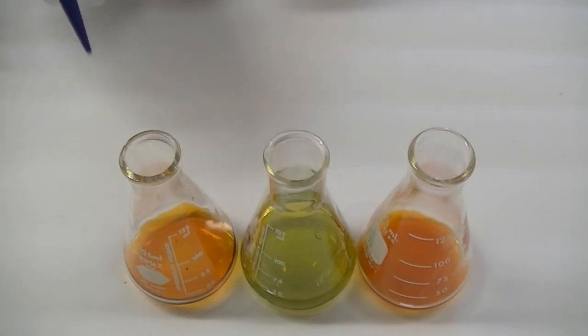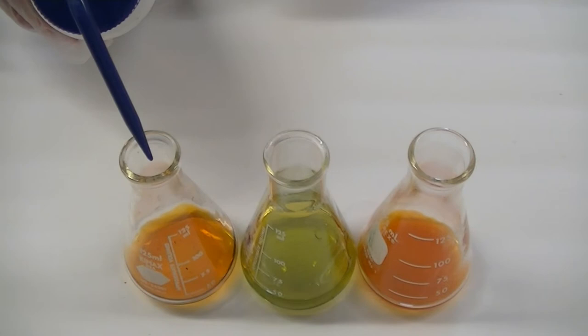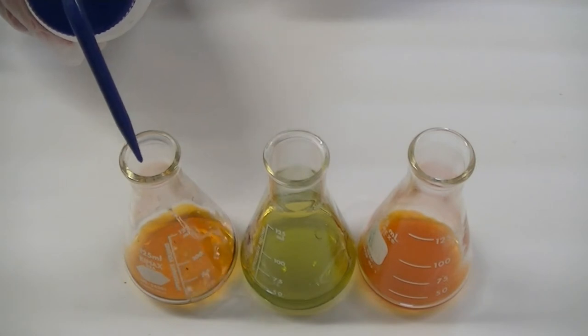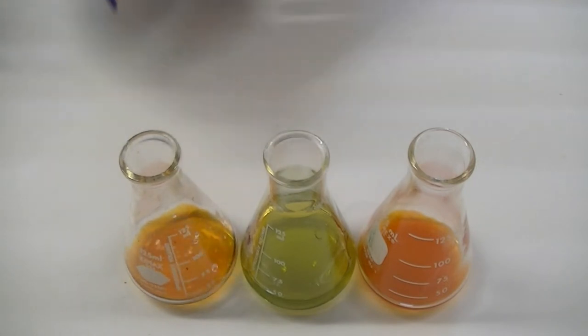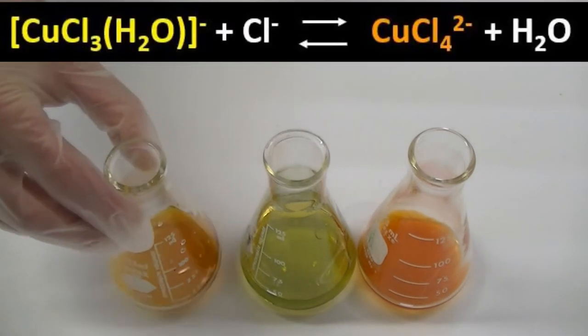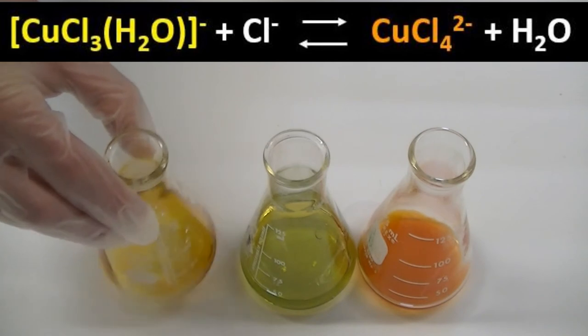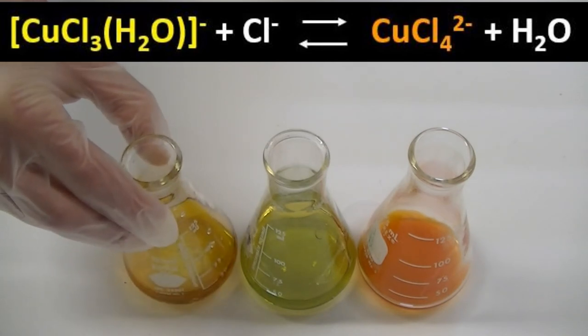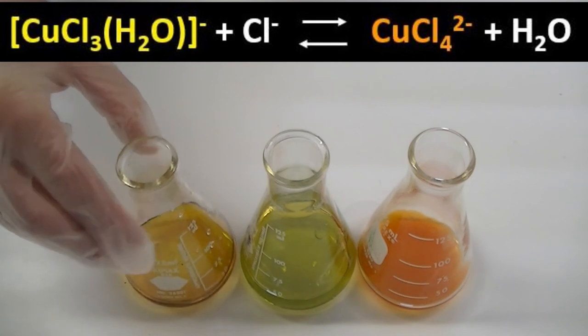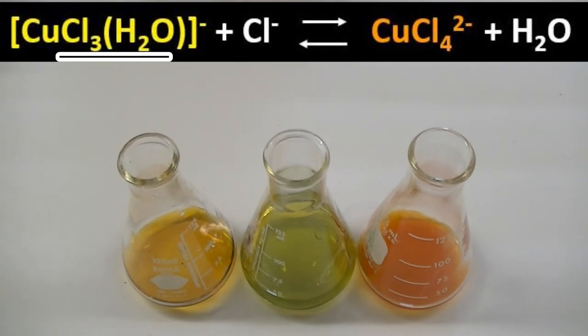The addition of water to an acetone-based solution of the tetrachloro-copper species induced a color change from orange to yellow. This color change makes sense if we consider the chemical equation above. Note that in this equation, a shift of equilibrium from right to left is expected upon addition of water. Also notice that such a shift involves the formation of the yellow-colored trichloro-copper compound, consistent with our observations.